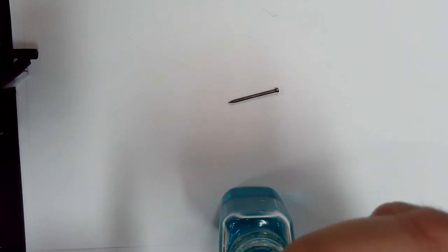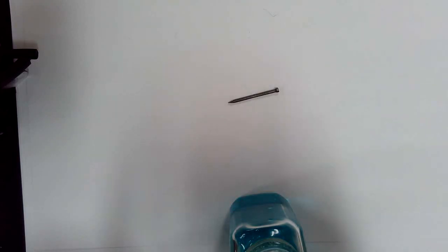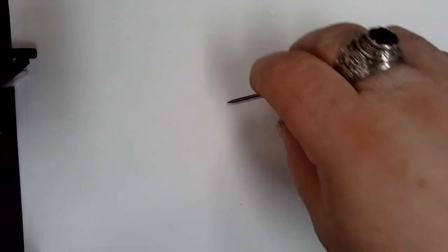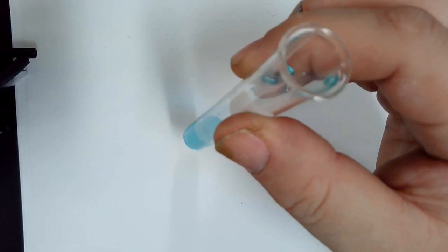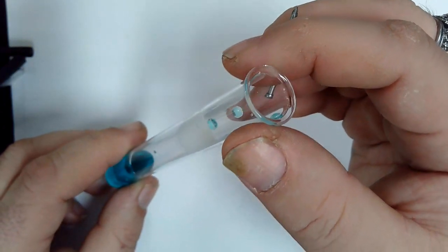So the entire nail is submerged, the entire nail experiences a reaction. And why does it have to be completely submerged for that? What am I looking for? What's the reason for entire submersion? Everything happens on the nail, in the tube, so it's an enclosed reaction. You guys are right on it, but you're missing the two most important words. Everything happens at the same time. Not same time, you have the first letter right.